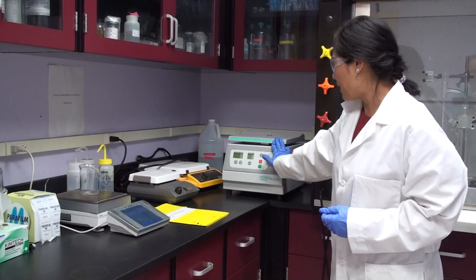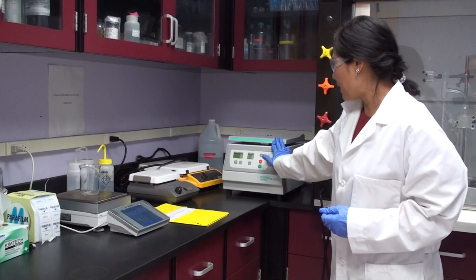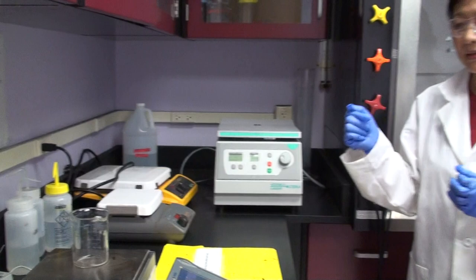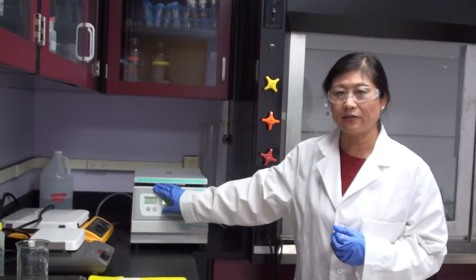We have our small heater here, and this one is centrifuge. In the centrifuge, you can separate water and liquid or water and another liquid or water and solid. It's very useful if you set different rotation speed. You can test it in 10 minutes, or in two hours, or in 10 hours.